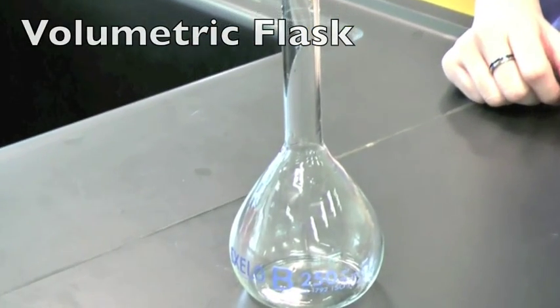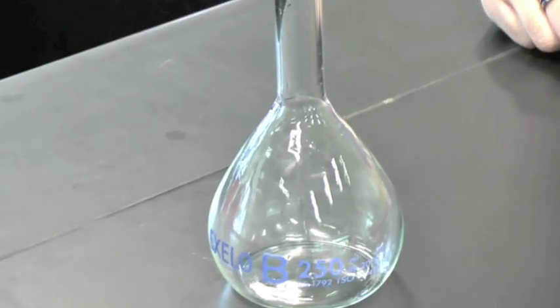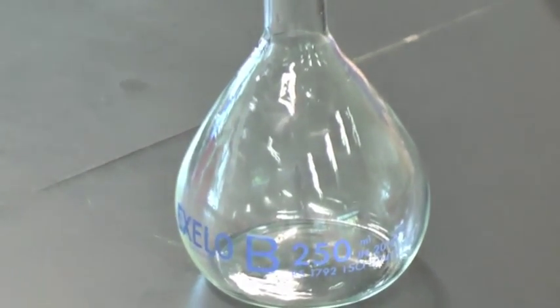This is the volumetric flask. It is used to prepare standard solutions.